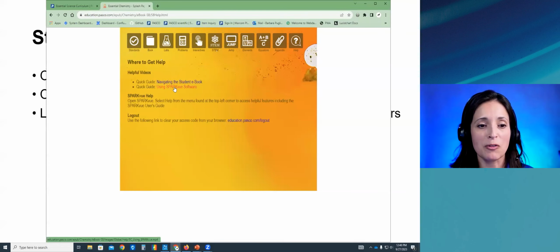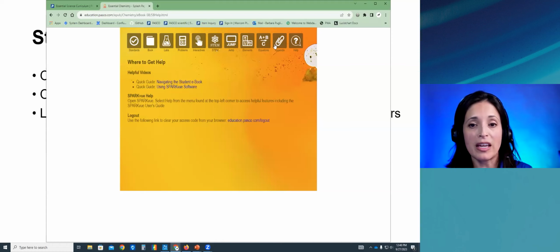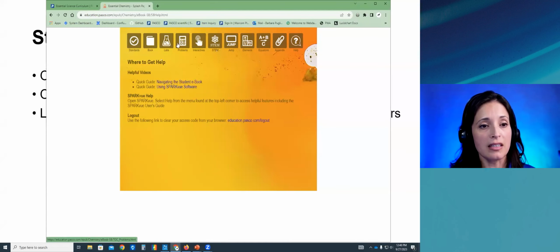There's also the first time they use SPARKvue software. What we did is we made this helpful video where we went through every single lab, and we looked at every single skill that students would need for all the analysis and all of the things that they're asked to do in all of the sensor-based labs, and we made a video that covers it all. So that help is right at their fingertips for not only the book, but also the software that goes with the sensor-based labs.